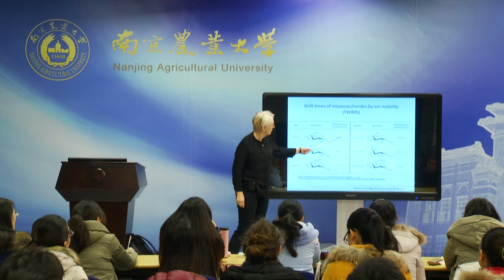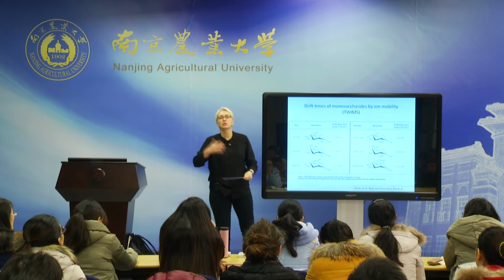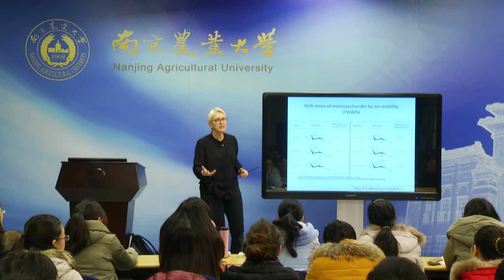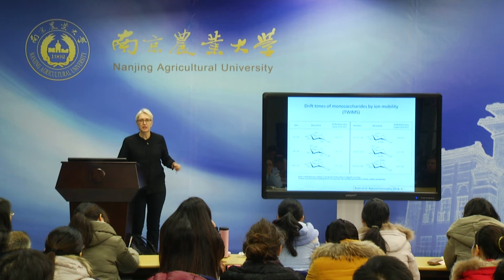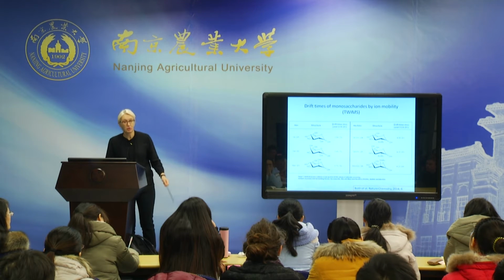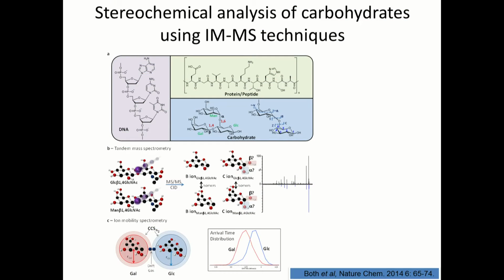And then these collisional cross-sections you can actually also calculate from your experimental data. So you can get these. So these are actually generally the values we look at from the drift times experimentally, but you can also calculate them. So that's also another feature of this. You can sort of try to predict what the collisional cross-sections of these molecules might be. Once we accumulate a lot of data, maybe we'll be able to sort of predict these, and that allows us maybe to avoid having to do massive numbers of measurements. So with this now, we can actually add to tandem mass spectrometry and look at these.